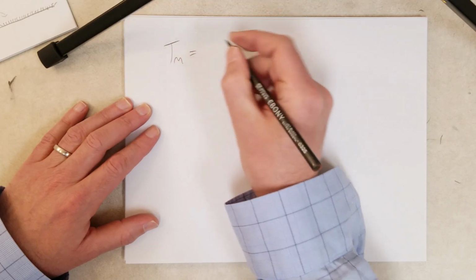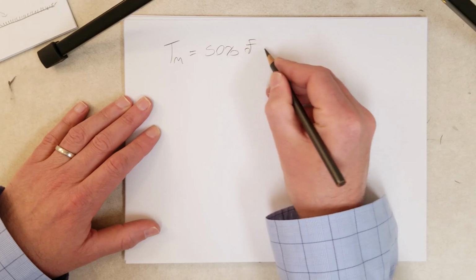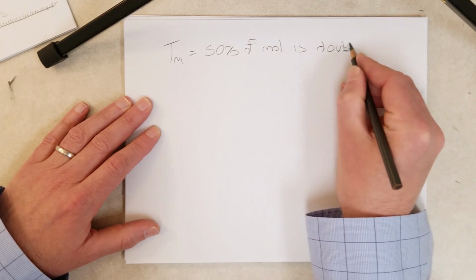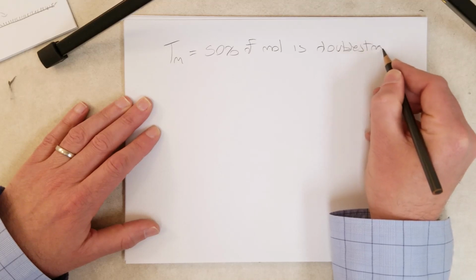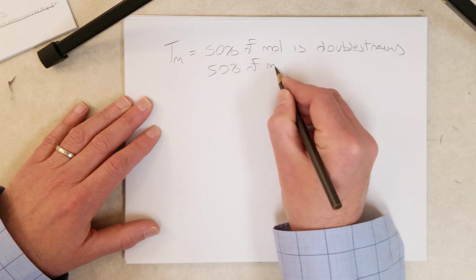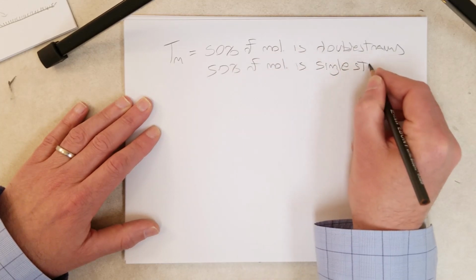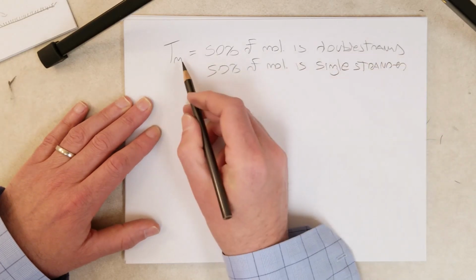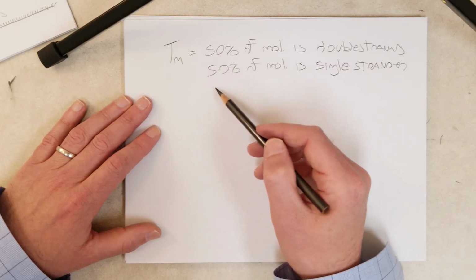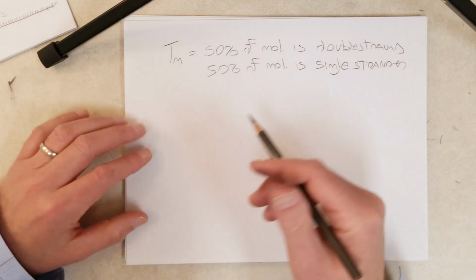The melting temperature of a DNA molecule is the temperature at which 50% of the molecule is double-stranded and 50% of the molecule is single-stranded. And at the melting temperature, the molecule should be at an equilibrium where some molecules that are double-stranded are becoming single-stranded and some that are single-stranded are becoming double-stranded.